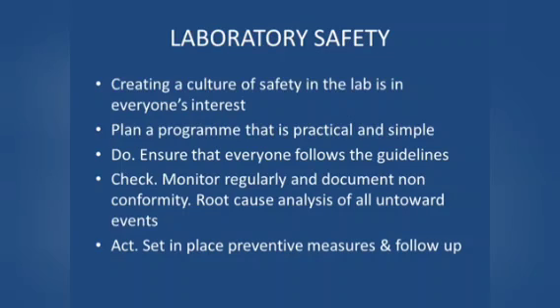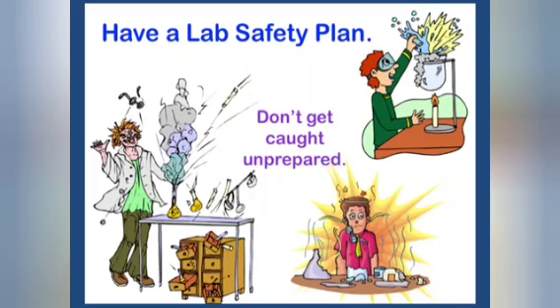Root cause analysis of all untoward events should be done, and set in place preventive measures and follow up. Have a laboratory safety plan in place. Do not get caught unprepared.